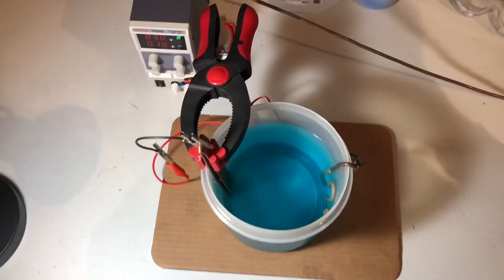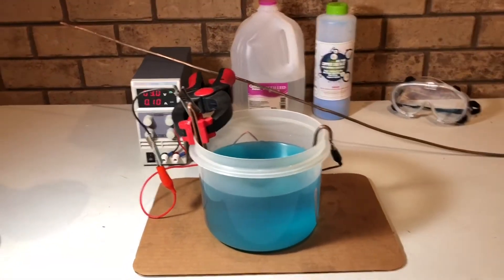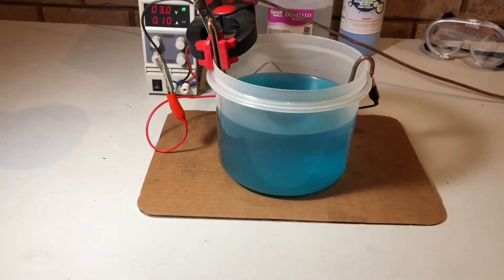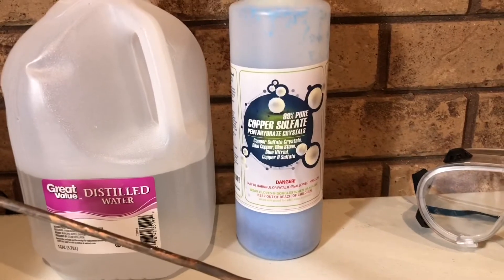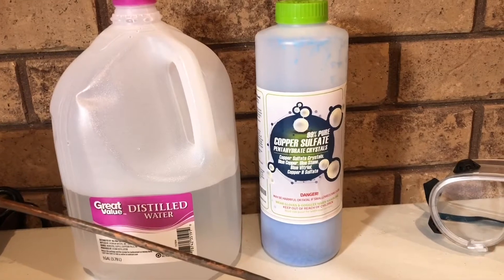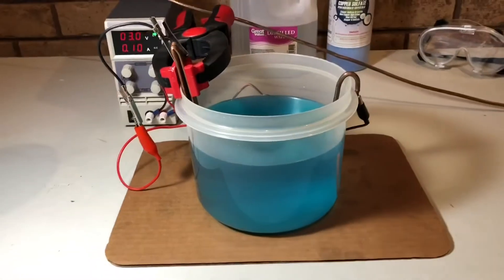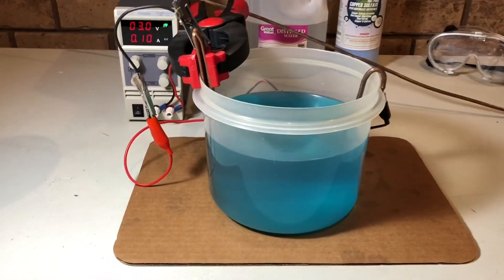As you can see I have an experiment going on which I'll explain in just a second. First I'll explain how copper plating works. Right here is a solution of copper sulfate which I made with this. You can buy copper sulfate crystals — I got these online. They're typically used to clean roots out of septic systems. I have some distilled water, poured in an amount that seemed about right, and stirred until it all dissolved. That's my electrolyte solution.